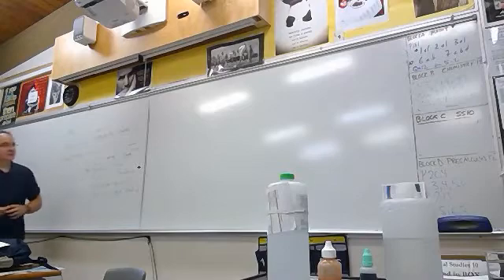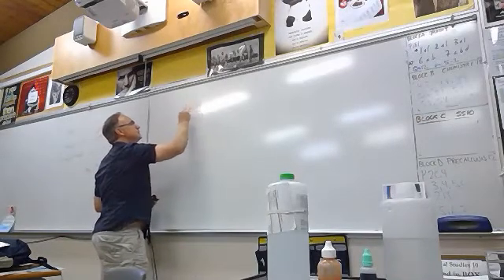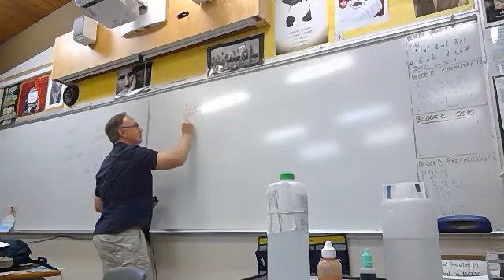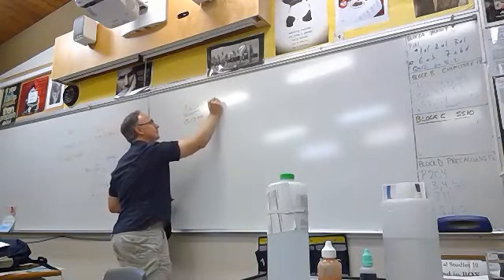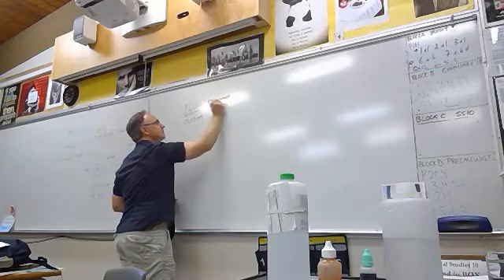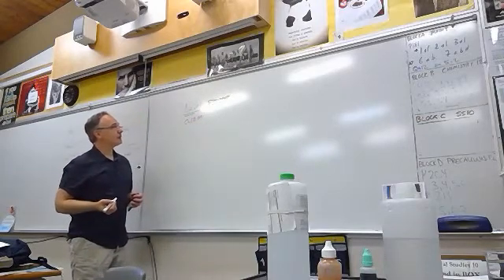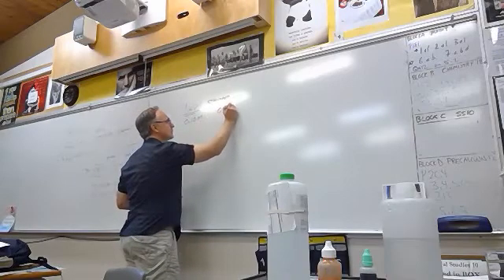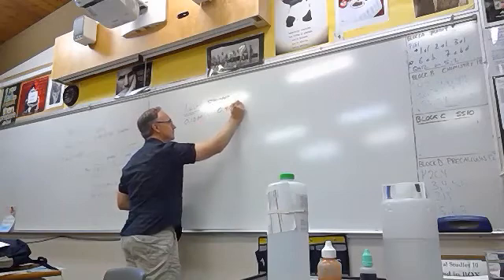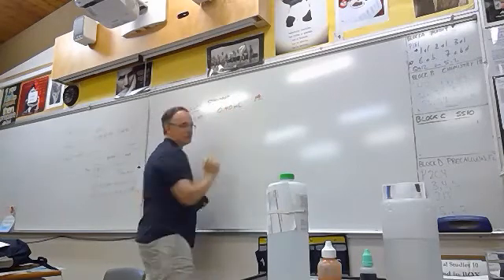Okay, so we're going to use sodium hydroxide. And that sodium hydroxide is 0.10 molar. That was our standard, so that's the thing we knew the concentration of. And we started with 0.40 milliliters in the burette. And then we added it, we got to 19.1.